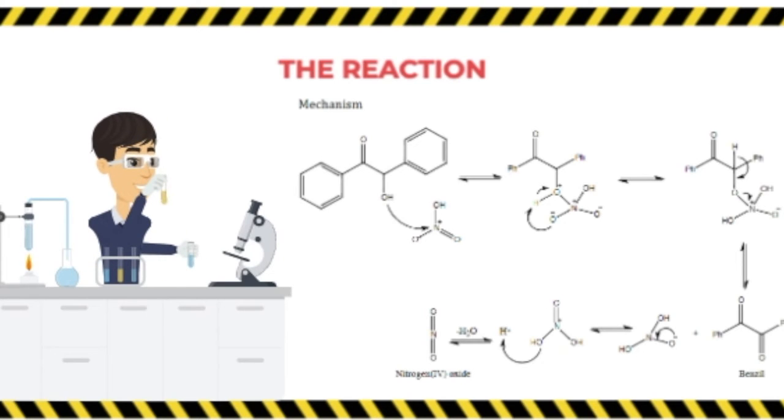So now that we've had that discussion, we're going to jump into the actual reaction pictured above, which is the overall synthesis of Benzil from our starting material, benzoin. We're going to start off with the step known as the condensing of benzoin. Here in this step, we took thiamine hydrochloride and turned it into thiamine, which is what we're going to use. We're going to use 3 molar sodium hydroxide, 2.12 grams of benzaldehyde, and 95% ethanol.